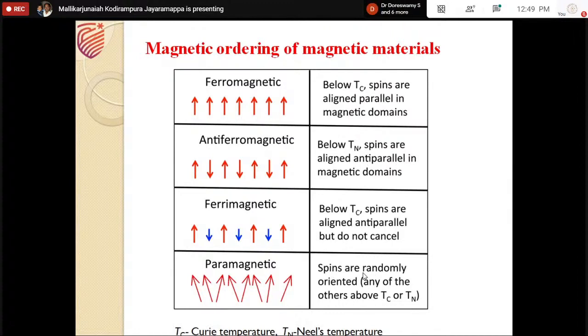Now we will take some of the magnetic systems and explore whether we can make any useful solid state NMR measurements in them also. Here, I am coming to the nano systems explicitly.